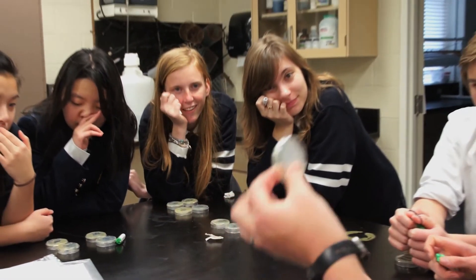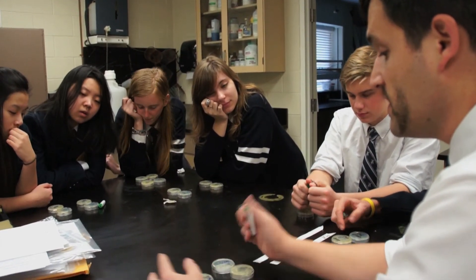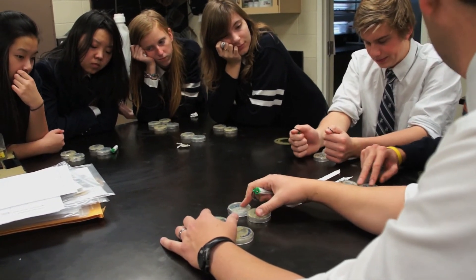Are your bacteria sensitive to ampicillin? Yes to both things. When we go over and look at this — both of those are control plates, aren't they? They're controlling for different things, but yes, they are both control plates.